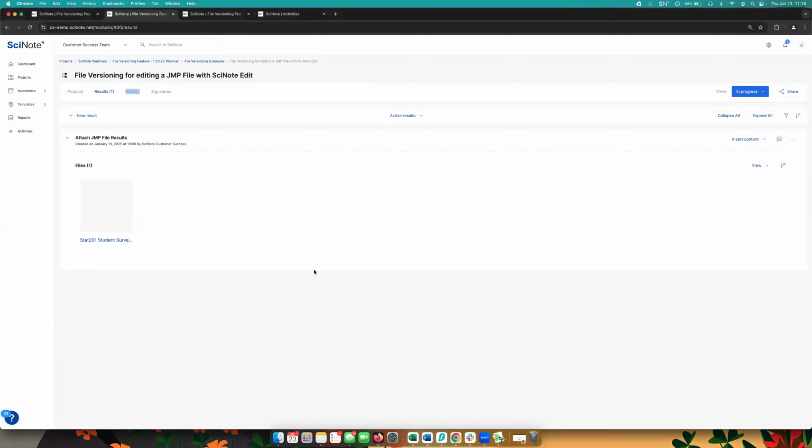Awesome, thank you. All right, like Nate mentioned, the next example we're going to go over is a JMP file. Now, again, the SciNote Edit functionality plus the file versioning history works with all file types. I picked a JMP file just because in my previous work, when working with scientific data, we often use JMP files and JMP for analysis. But again, this could be any statistical software or any other analytical software that you're using.